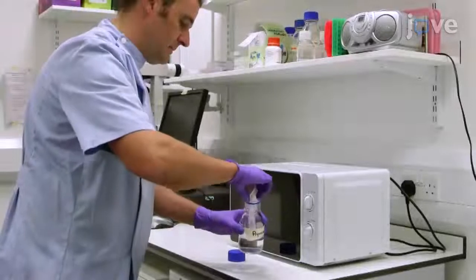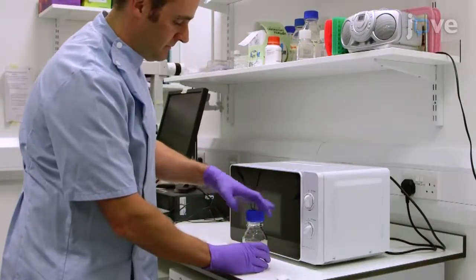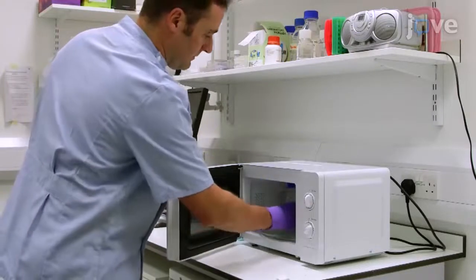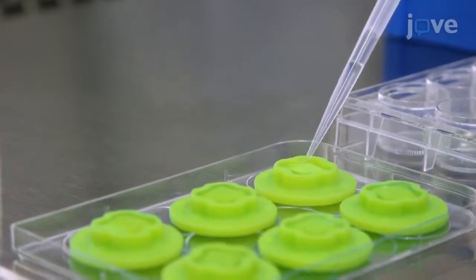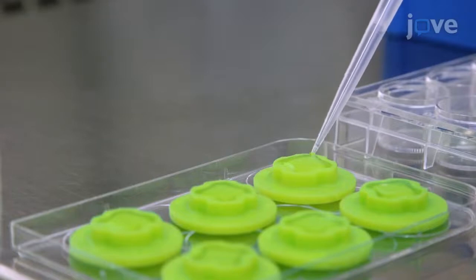Prepare 2% agarose molds by dissolving 2 grams of low melting temperature agarose in 100 milliliters of sterilized distilled water. Carefully heat the mixture in the microwave with interval shaking to dissolve the agarose completely. Add 520 microliters of the melted agarose to a 256 well format mold and allow it to solidify.